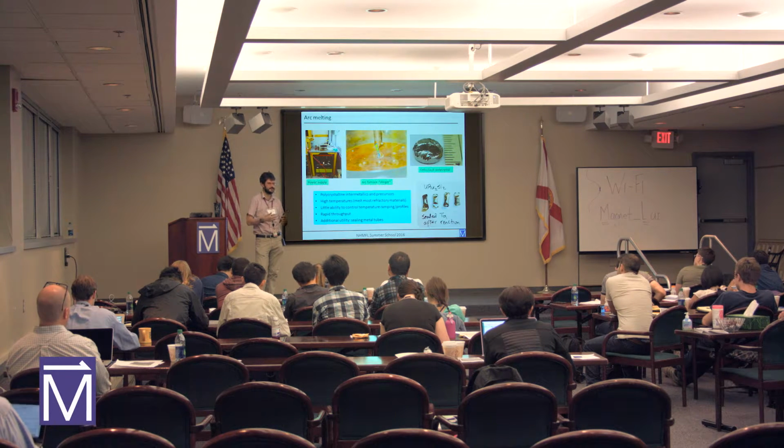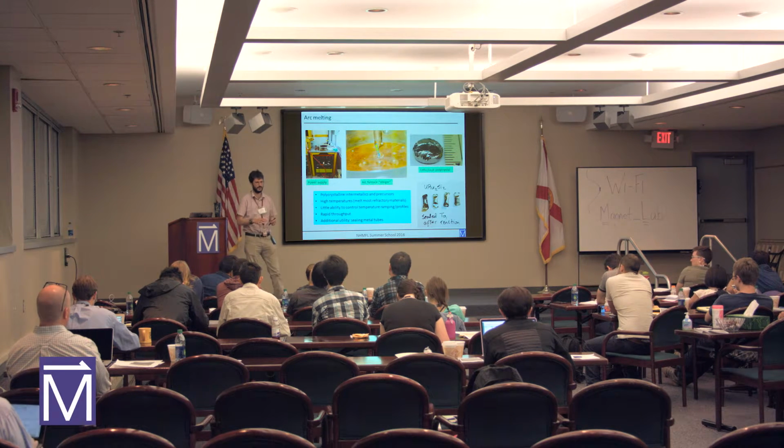And you reacted it, you had 90% YBCO, and you still had 10% yttrium oxide, barium oxide, copper oxide. So you just want to put those things, as much as you can, in contact with each other and drive their reaction again, and then do it again and do it again. I think if you ball mill something and then just have the powder spread out and react that, there's going to be a lot less opportunity for those non-reacted pieces to encounter each other.